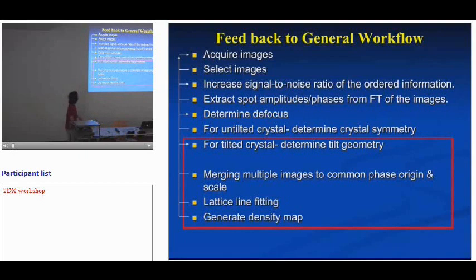Basically, what I'm trying to say here is that we are doing all these mergings and determining tilt geometry, merging them together, doing lattice line fitting, generating density values. That's not the end of your project.